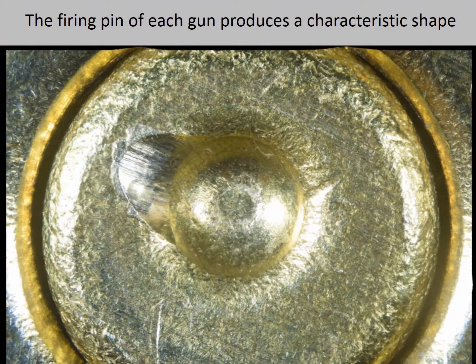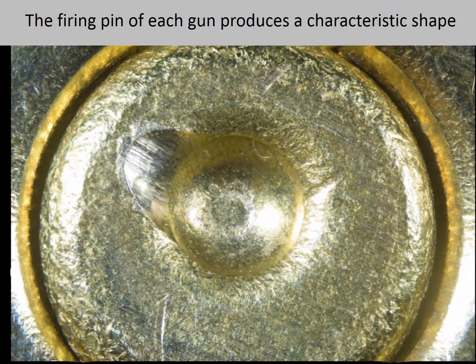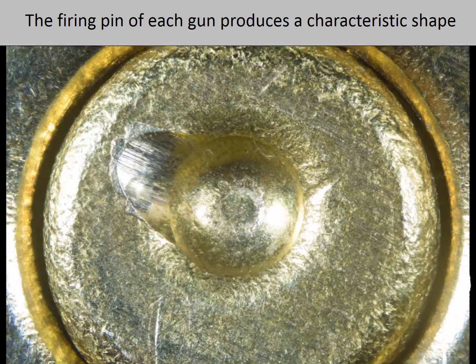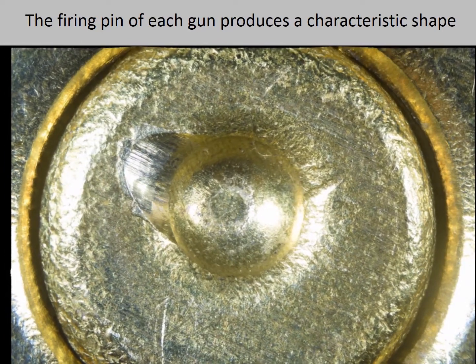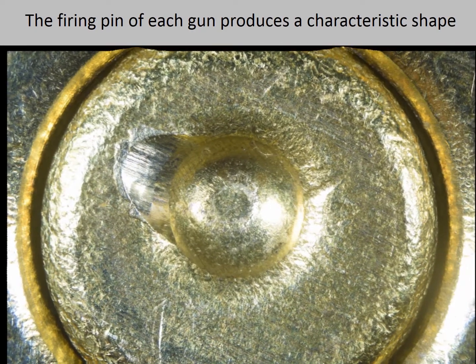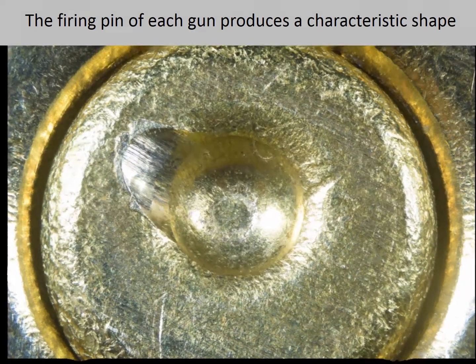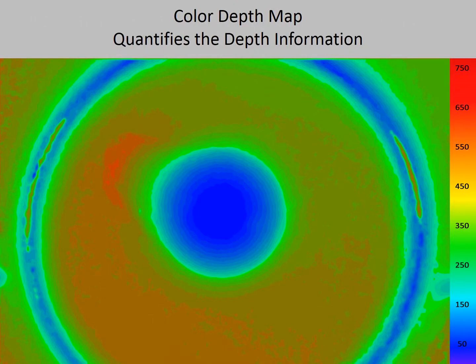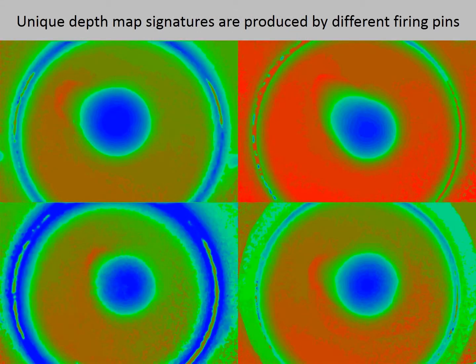Here is a three-dimensional video of the firing pin impression made using a different gun. Each firing pin of each gun produces a characteristic shape. Here is the color depth map that corresponds to this particular firing pin. Here are the depth maps produced by the firing pins of four different guns — each firing pin produces a unique depth map signature.